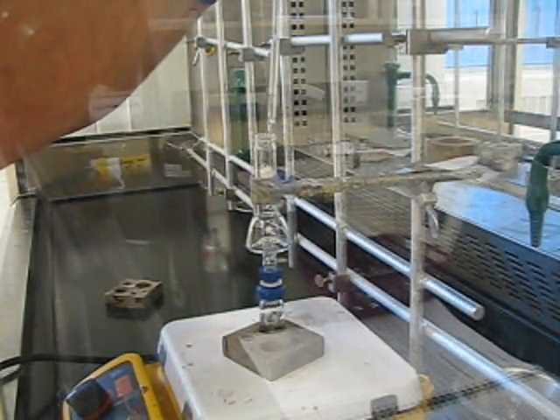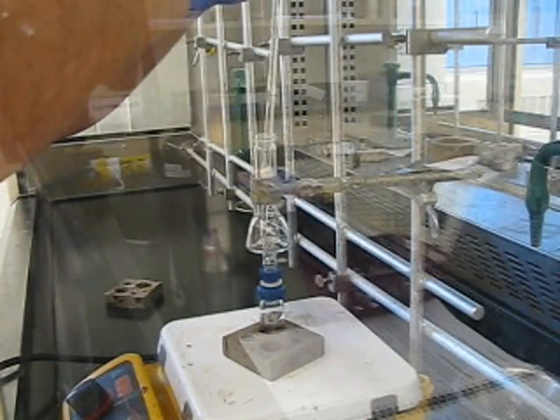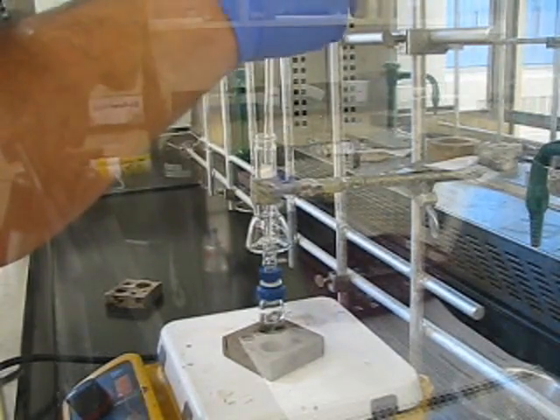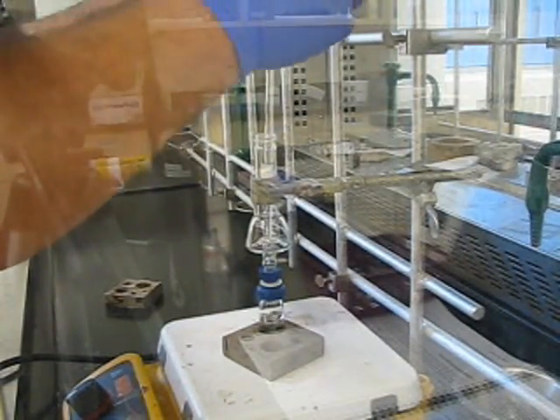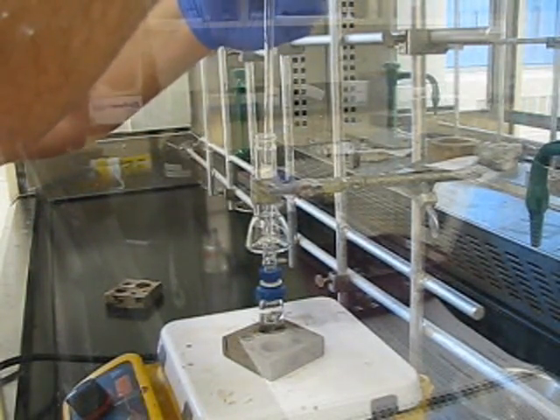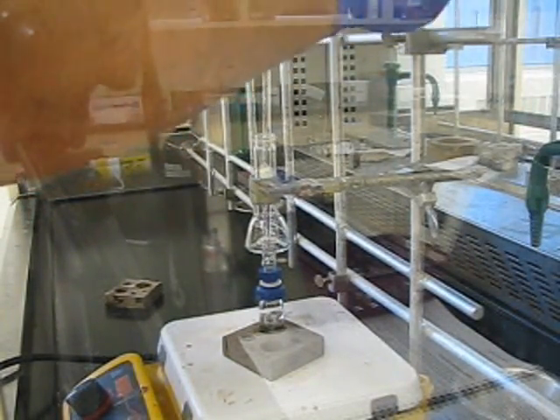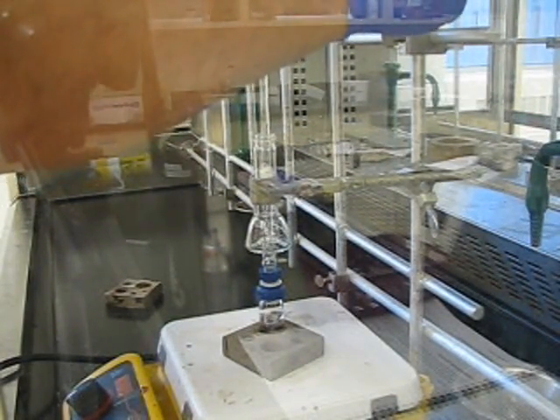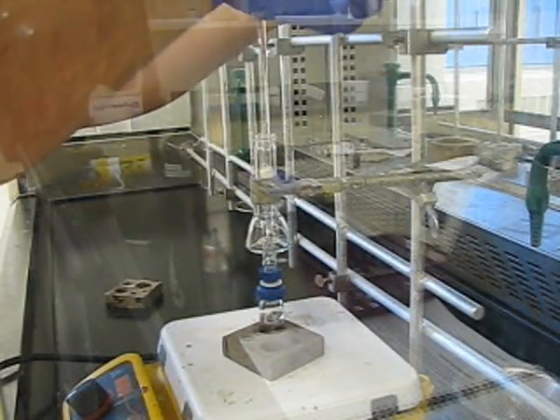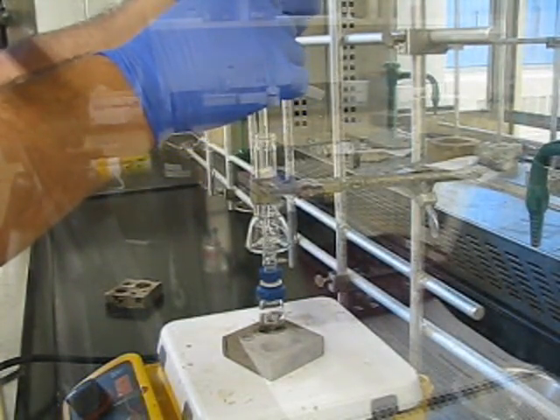Speaking of heating, a thermometer is what you're going to need next. Clamp it similar to how you clamped the pipette column in the chromatography experiment. When setting this up, you may have to adjust how far out it is from the rack and how high up it is, so that you're not obscuring any temperature readings you'll need. For example, it would be a poor idea to block off or limit visibility of the numbers between 70 and 80 for this experiment.